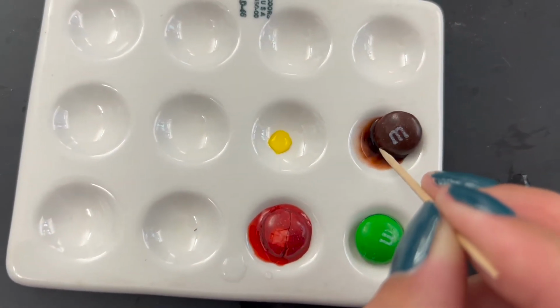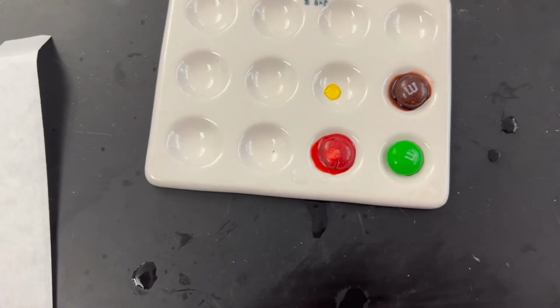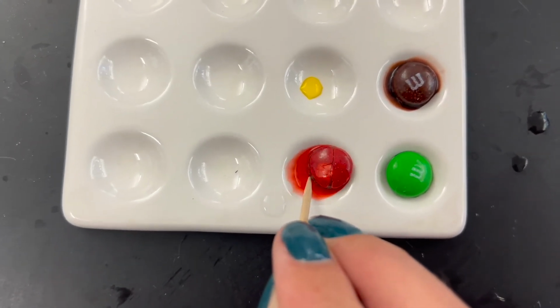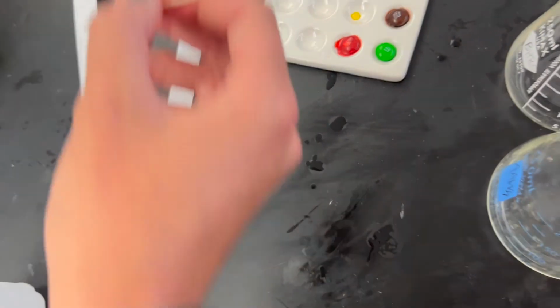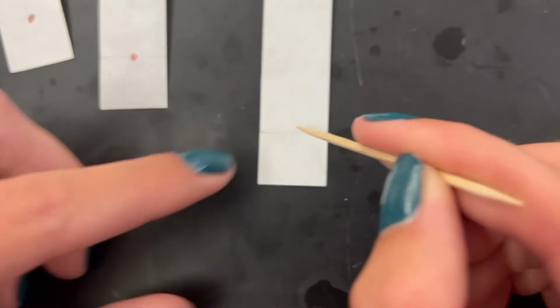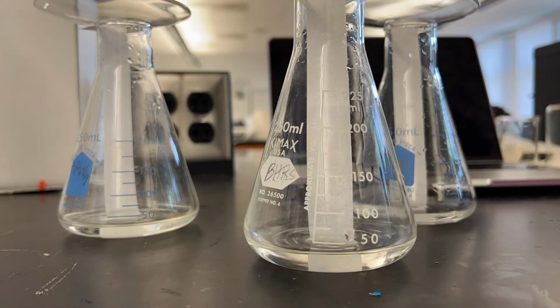Using a clean toothpick, place a dye dot on the pencil marking on one of the chromatogram strips. Keep the spot as small and concentrated as possible when you do this. Do this for 2 different dye colors and the tartrazine sample, so you have 3 chromatograms in total. Allow the dye dots to dry completely before repeating this process 5 to 6 times. Try to keep the dots as small and precise as possible because you want to increase concentration, not surface area, of the dye samples.